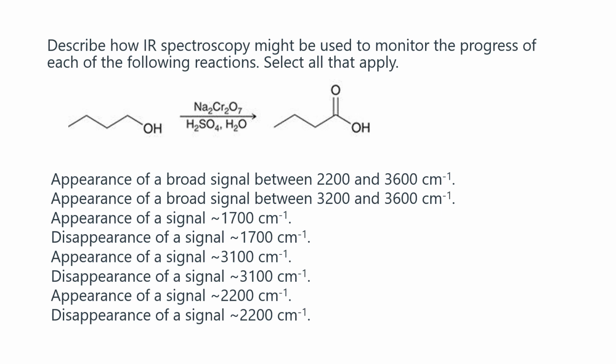That's that. Okay. Now here, another use of IR spectroscopy is how we can monitor reactions. So what do you observe at the beginning and what you have at the left? So this is an oxidation, and this is Jones reagent that is making chromic acid. And again, you see the primary alcohol is going to be a carboxylic acid. So here I should be seeing the OH band should disappear and the carboxylic acid should appear.